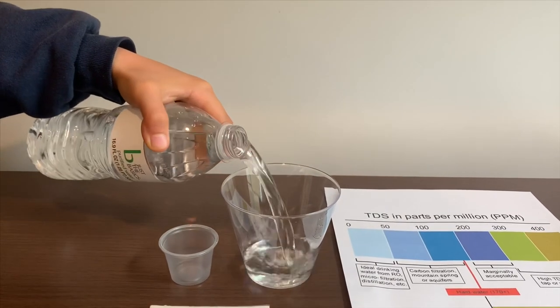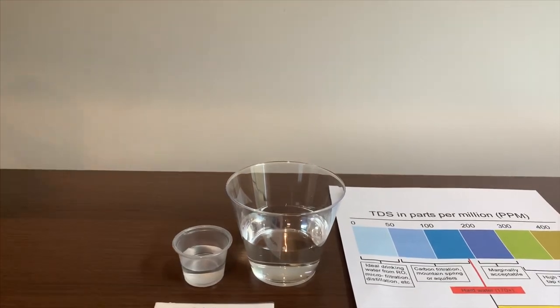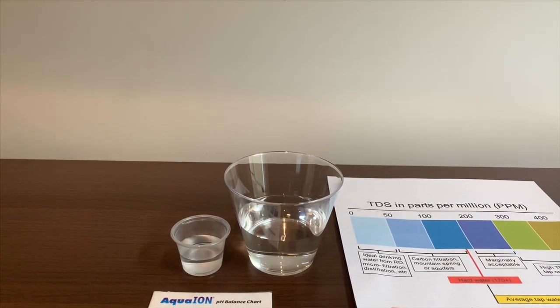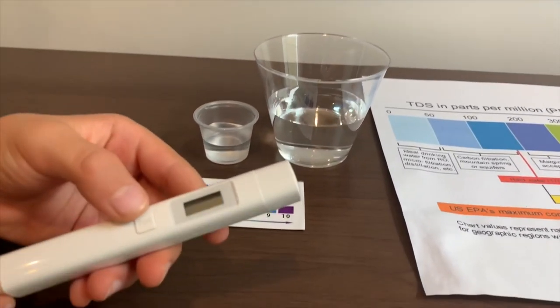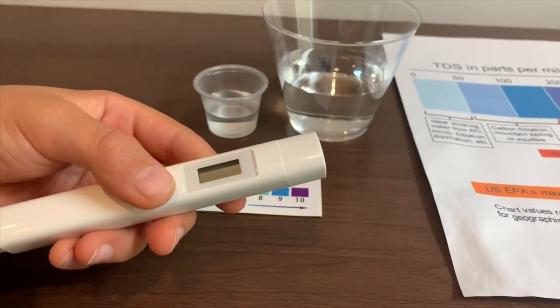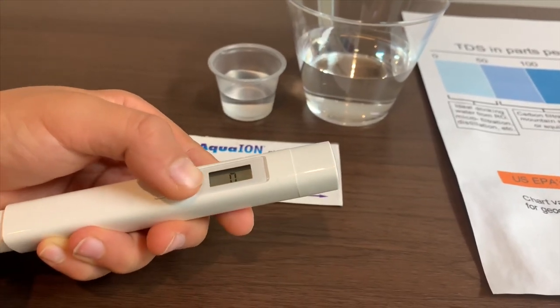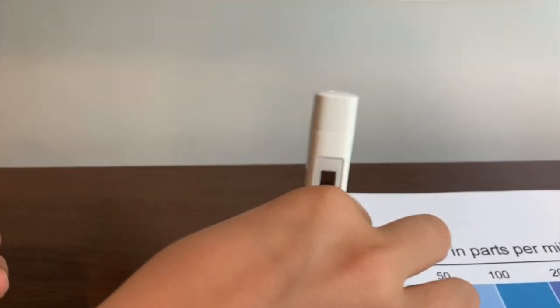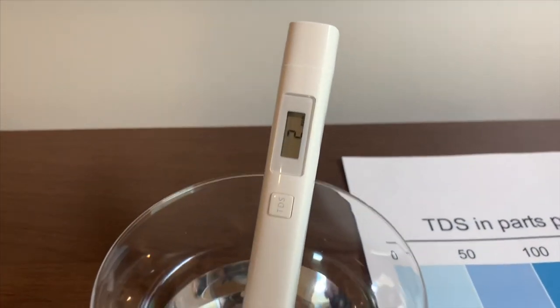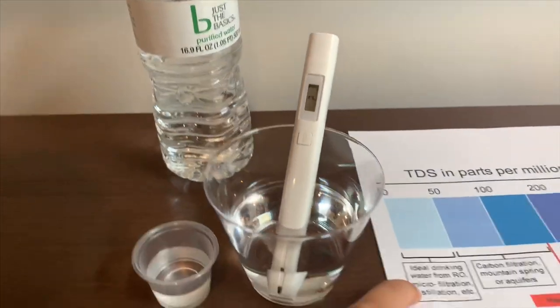Let's pour some water in. First, let's test the TDS level. If you want to buy this TDS tester, check the link down below. Turn on the TDS tester, make sure it says zero, and put it in. Two — that is ideal drinking water.